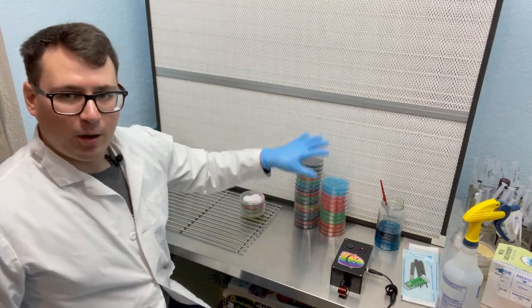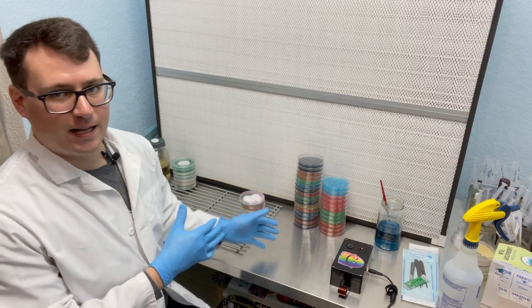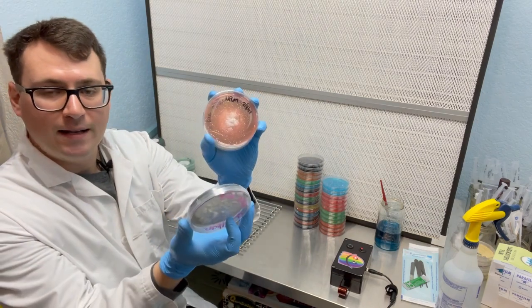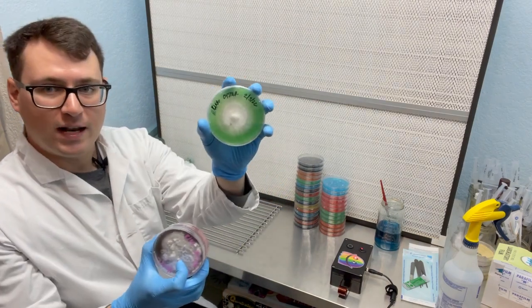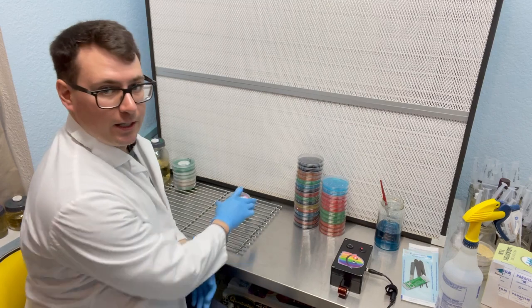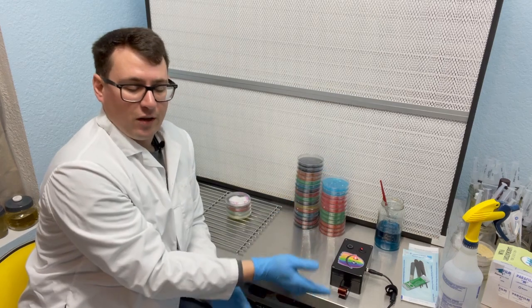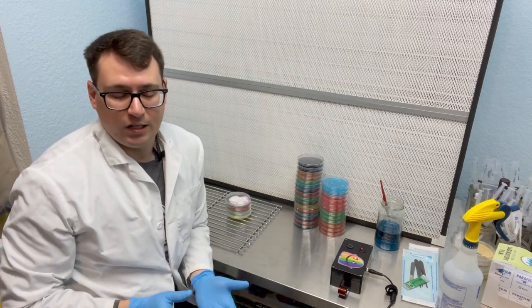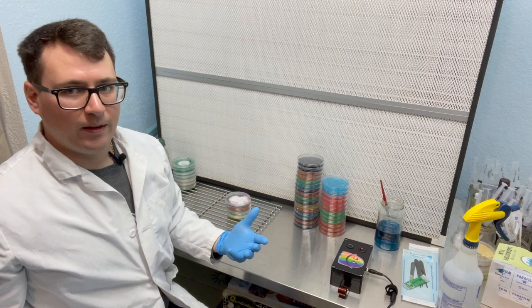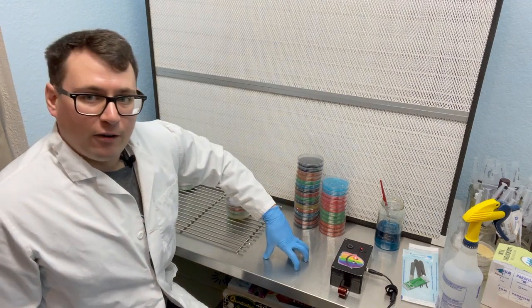I just pulled out a bunch of petri dishes from the fridge. There's a few of them with some condensation, but that's not a big issue. And then I also have a few different mycelium cultures that I'm going to be transferring. I want to do a few different types of mycelium so that if there is any carryover, we'll know that it was from not thorough sterilization. I didn't want to just use the same mushroom over and over again, because there's no way to tell if, switching between species, you're going to have carryover of that mycelium.